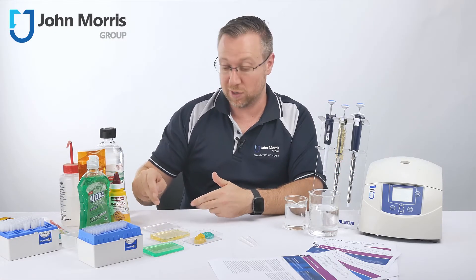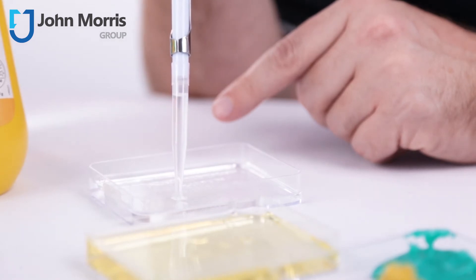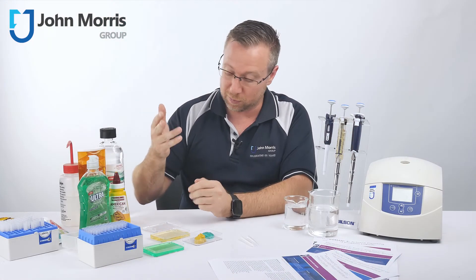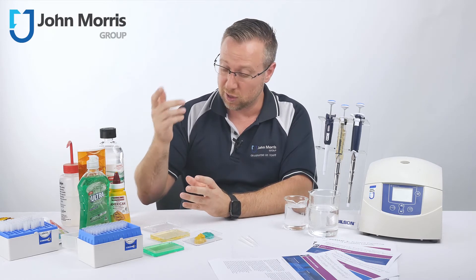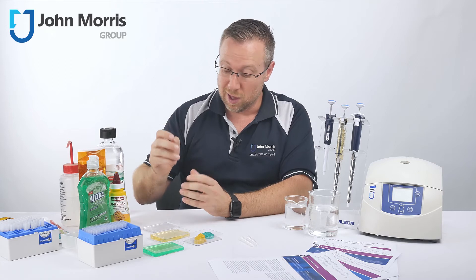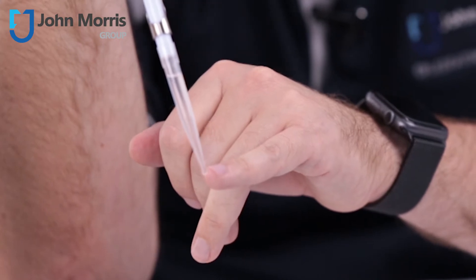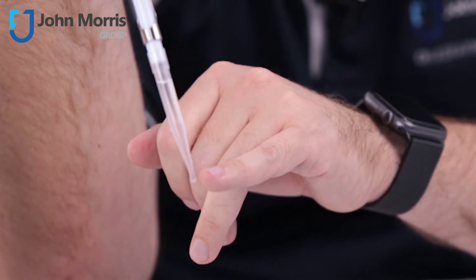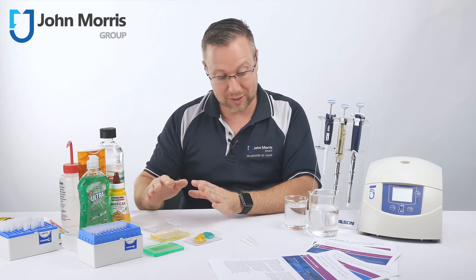Here we have a solvent — it's actually evaporating at room temperature; almost half of it has gone. As soon as it's sucked into an air displacement pipette, two things happen: the vapors will enter the body of the pipette, potentially corroding internal surfaces, and they'll also replace the vacuum being created, causing the liquid to drop out the bottom of the tip. We're not going to have any of these problems with a positive displacement pipette, and you're going to see that.